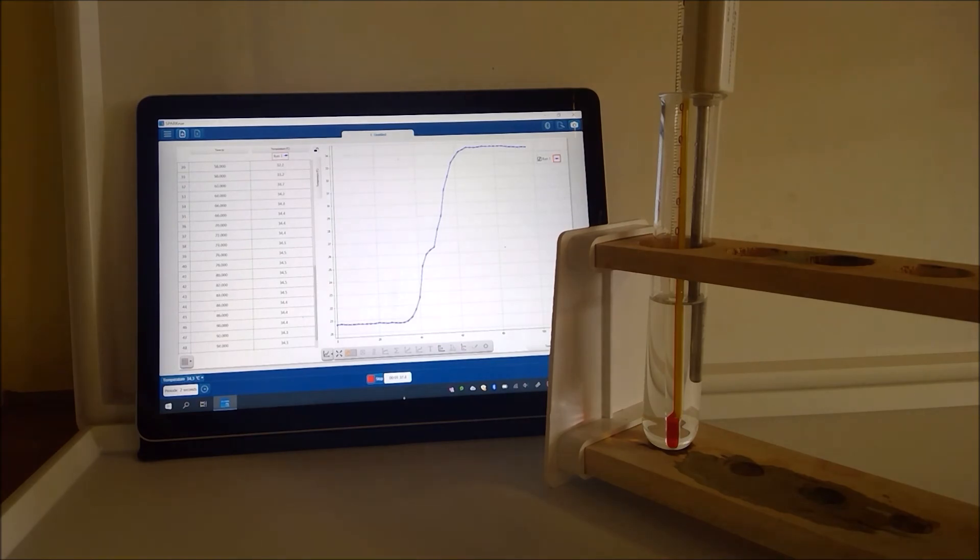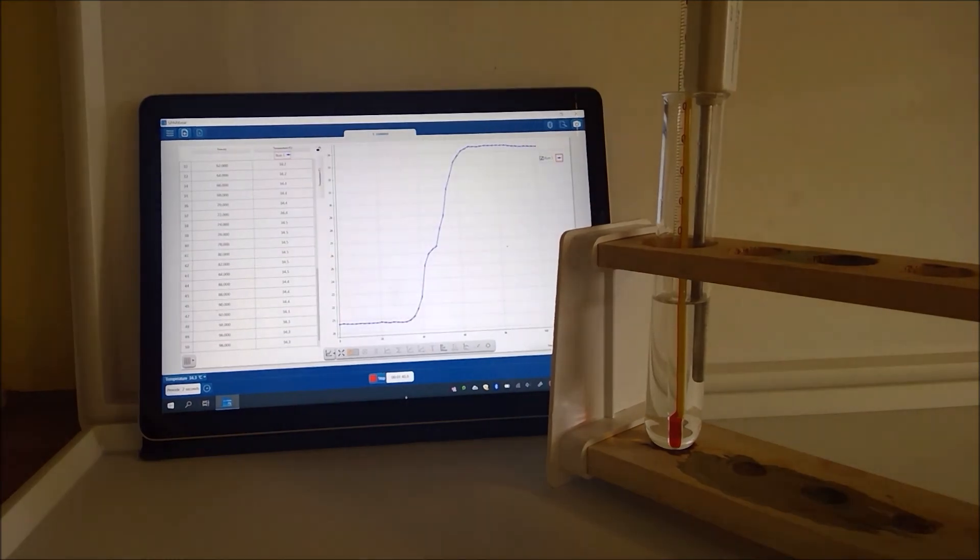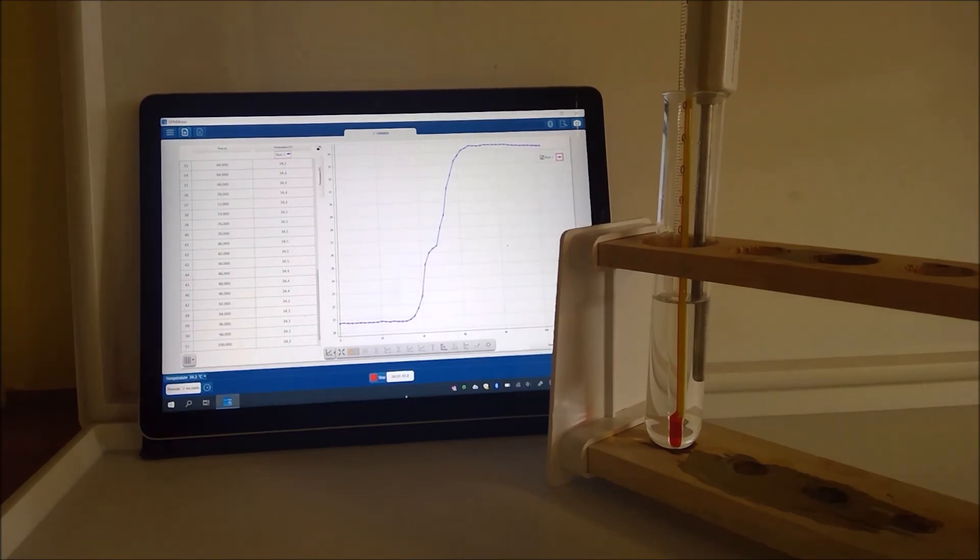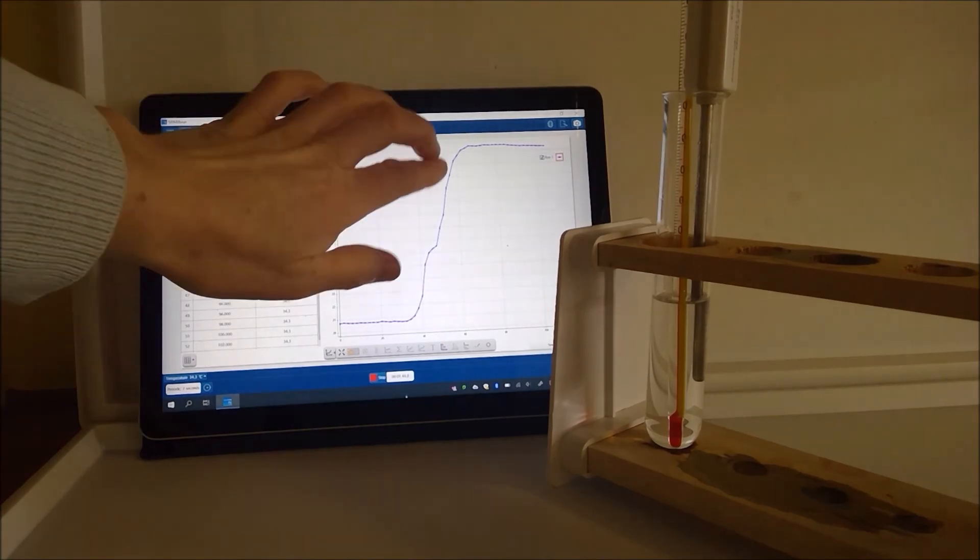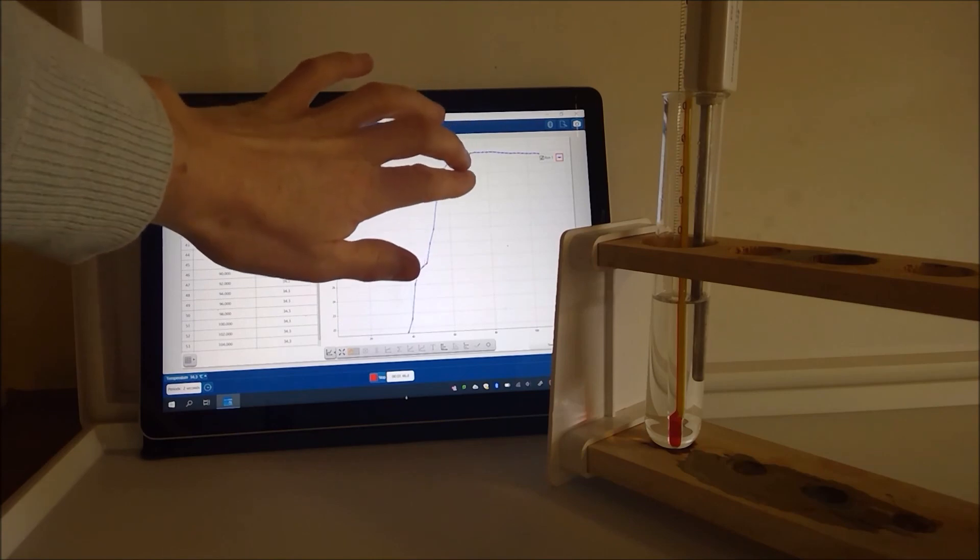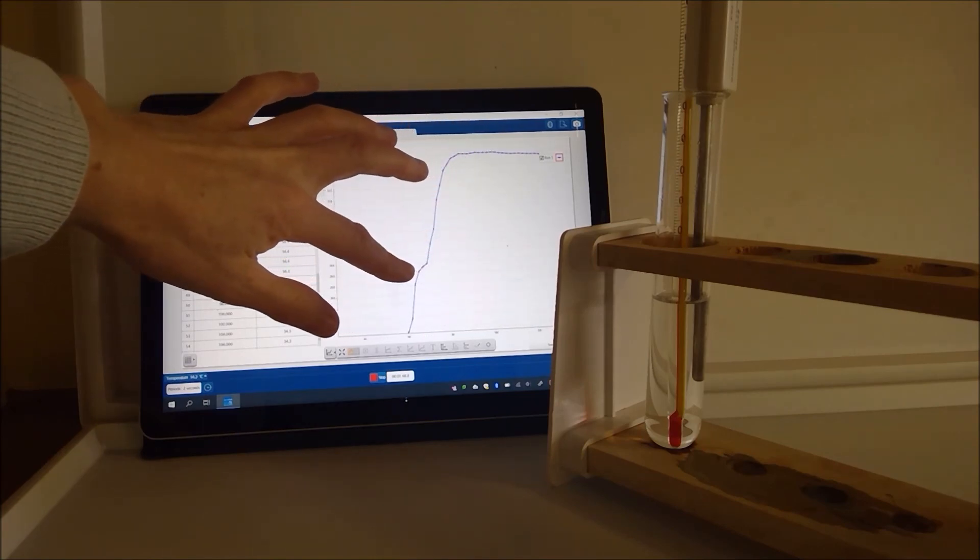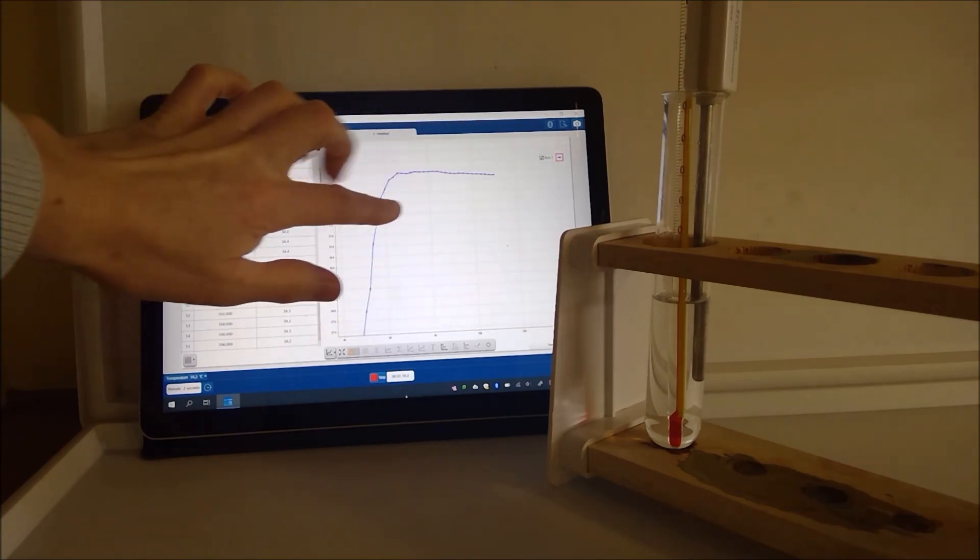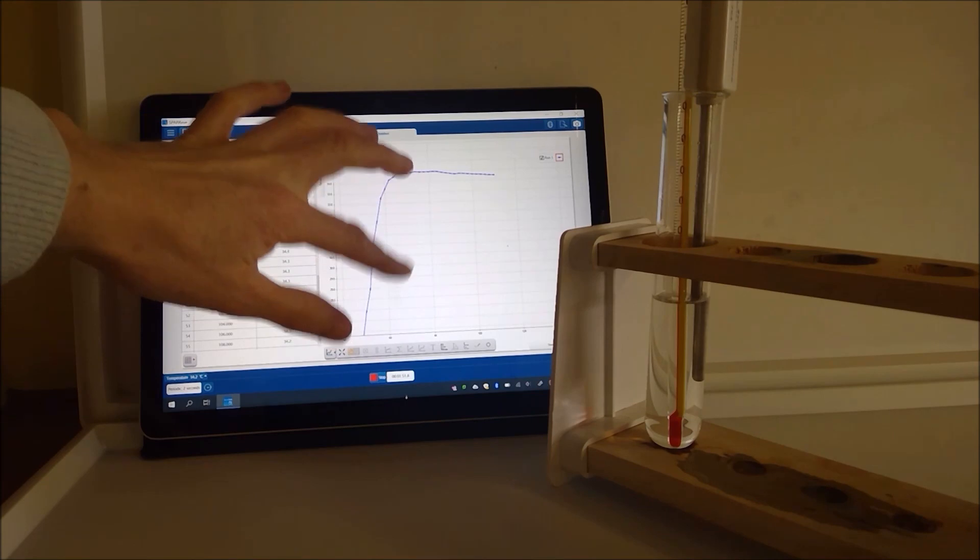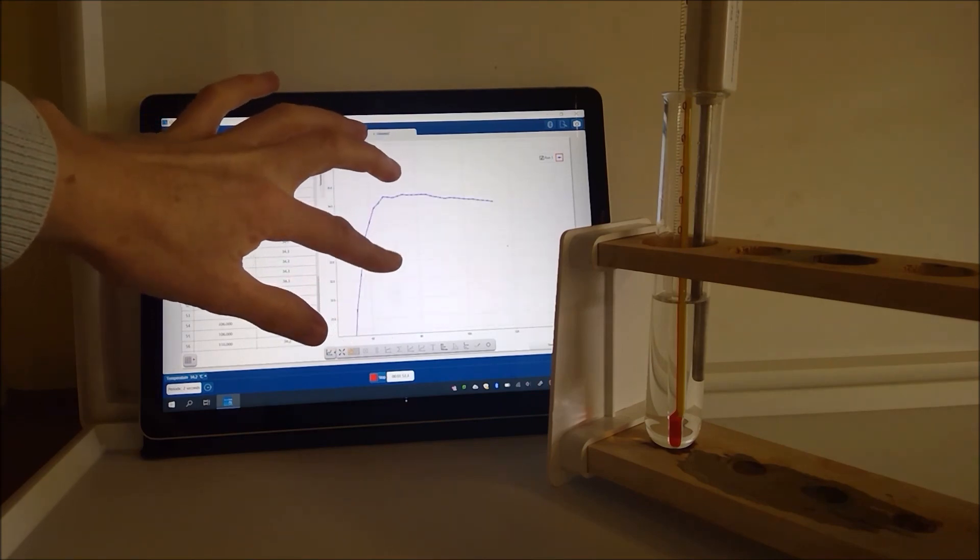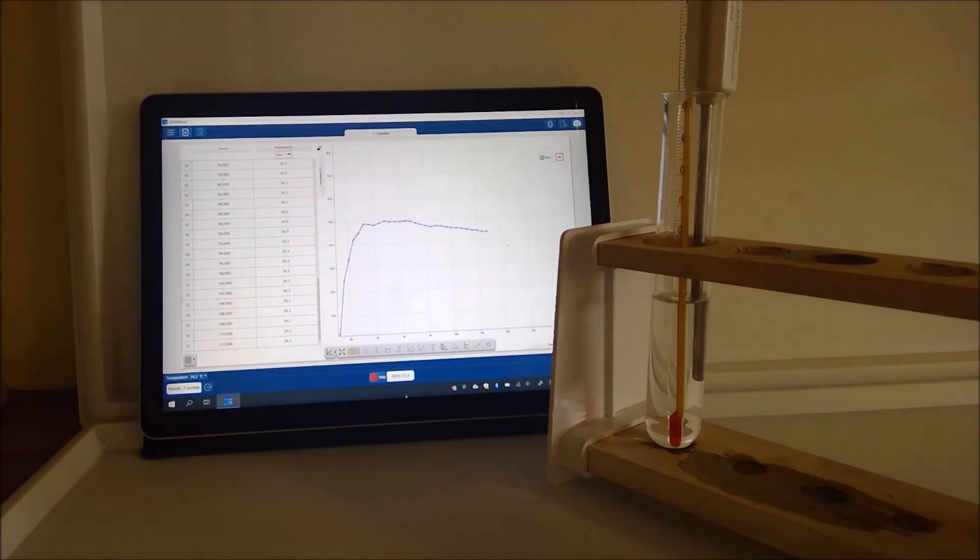Okay now on the data logger here it might just be worth a little think. Can I expand into this section there we go. So if we have a look at what's happening to our temperature now.